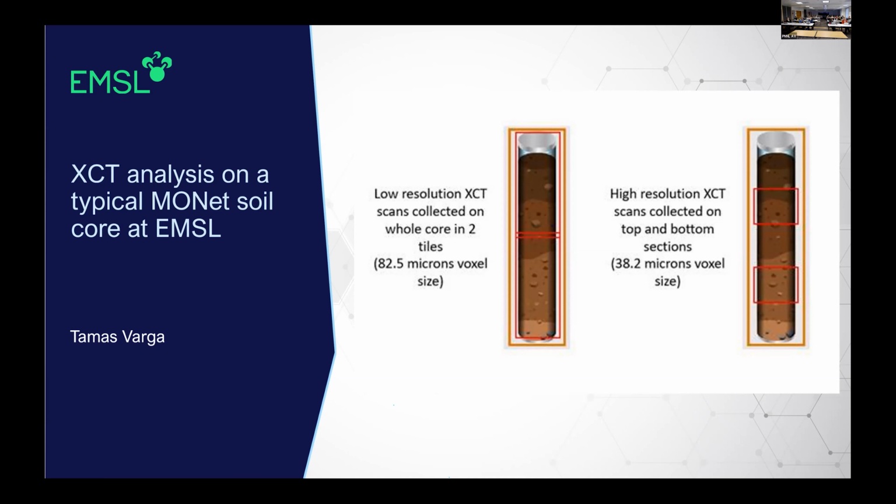So we have plans to supplement our lab-based imaging with high resolution micro CT, both from the larger cores, but potentially subsampling the cores and doing micro CT. We don't capture cores that are smaller than 50, 70 microns in this data. So there's still a lot there to capture.